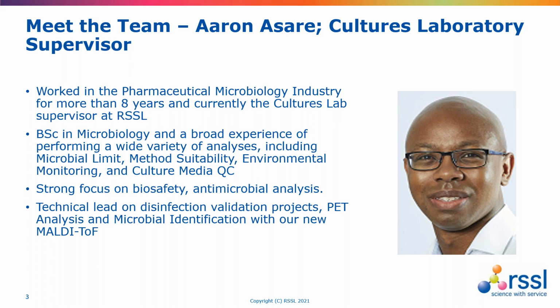So as we've mentioned, you're heavily involved in running the disinfectant validations for our clients, and disinfection validation is one of the key elements of Annex 1. What are the main challenges with this type of analytical service? Well, from our perspective, being a contract laboratory, it can be quite complicated to manage these kinds of projects because they are bespoke to every single client. Depending on your facility, you'll have different services, require different disinfectants, and have different organisms that you want to include in the validation. They vary so much. So managing the projects is the most difficult thing from our perspective.